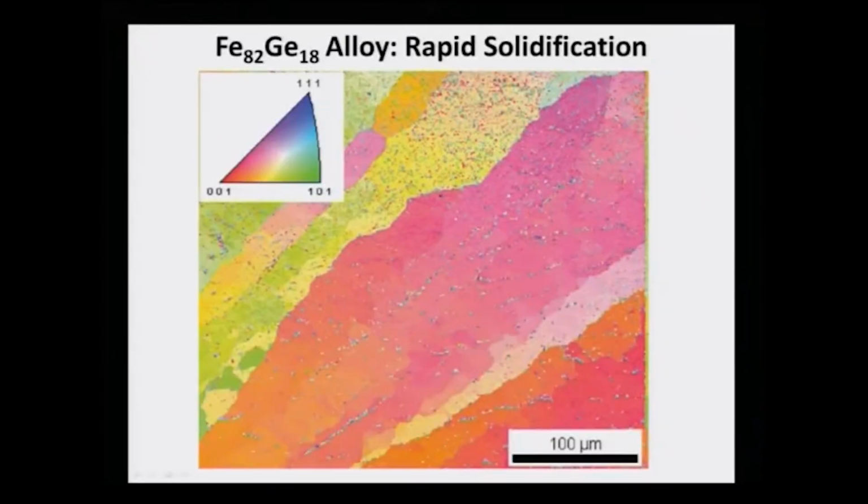One is that there is a subsequent grain refinement, grains are getting smaller and smaller as your undercooling increases, and at the same time these finer grains basically have small angle boundaries. So, just by doing this EBSD analysis one can tell that these grains most likely have formed by recrystallization, and if they have formed by recrystallization, obviously a distinct texture of the material will also be visible. So, if I just do a grain map and plot it in different color format, we can see there are very large grains.